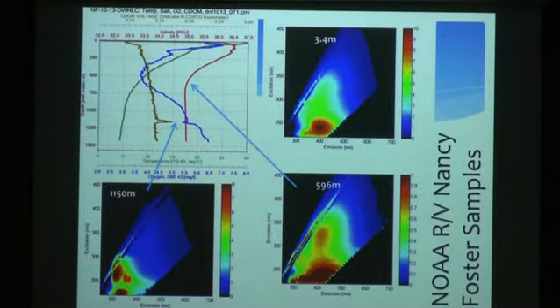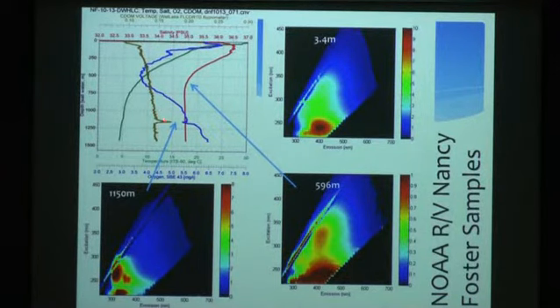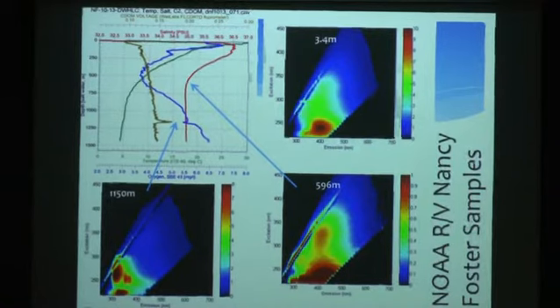People were doing profiles, so I'll start up here with this profile. The green is temperature. This is salinity. The blue is oxygen, and you see this little subsurface blip here. And this is from one of the CDOM, a WET Labs CDOM fluorometer. People were observing this little blip in oxygen and fluorescence at somewhere between 1,100 and 1,300 meters.